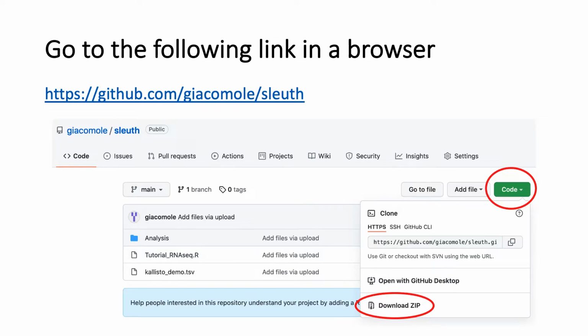Hopefully it's a fairly quick download. Someone in the room could let me know if they have that or are having troubles.